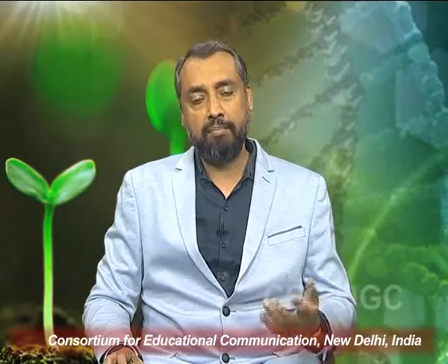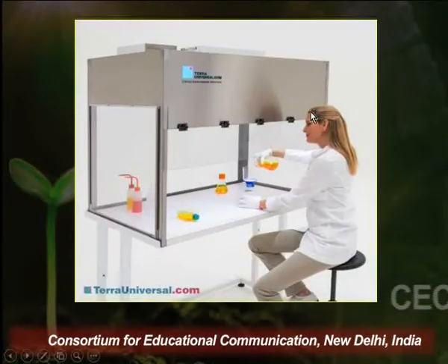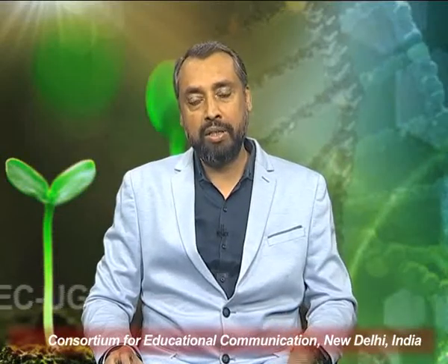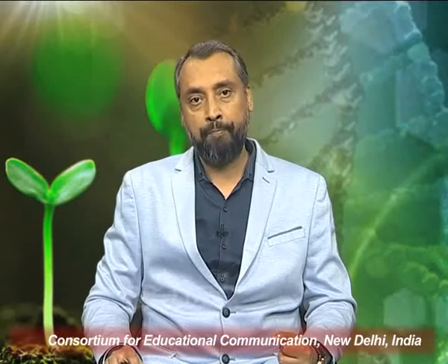This is a picture of a laminar flow hood. So this is a cabinet under which there is a flow of air which is maintained, and this flow of air ensures that there is no contamination inside this entire chamber.